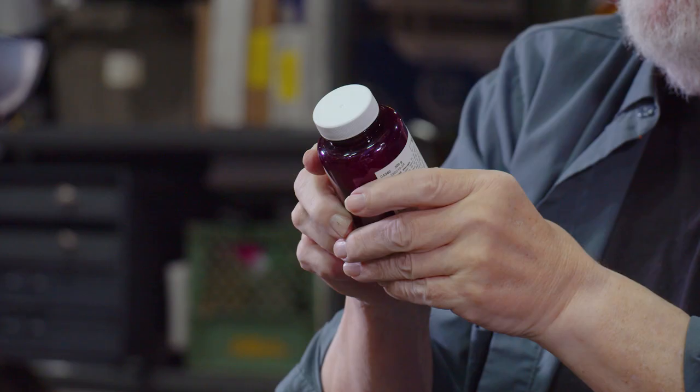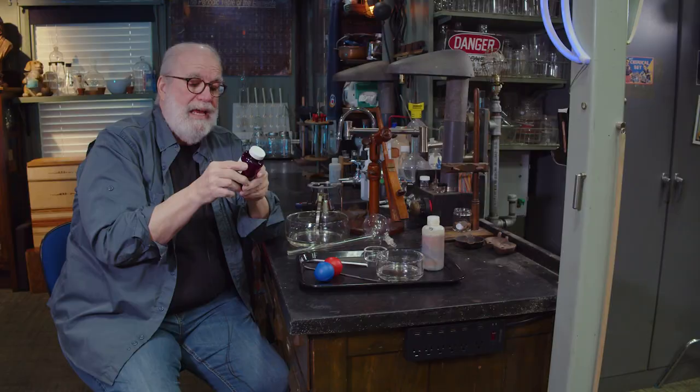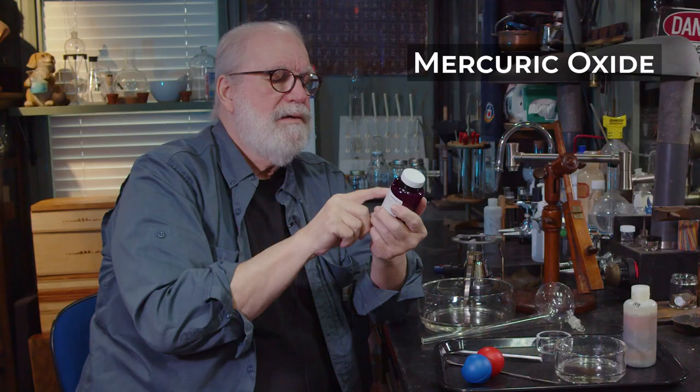Fatal if swallowed. Fatal in contact with skin. Fatal if inhaled. Sounds like my wife's cooking already. And it says right here: mercuric oxide. Red. What in the world is mercuric oxide?